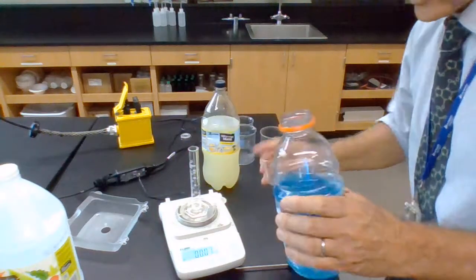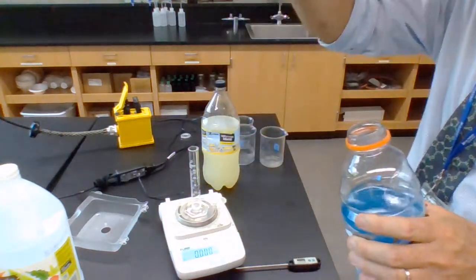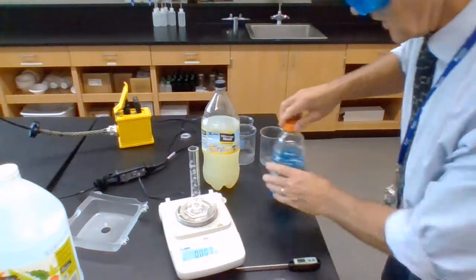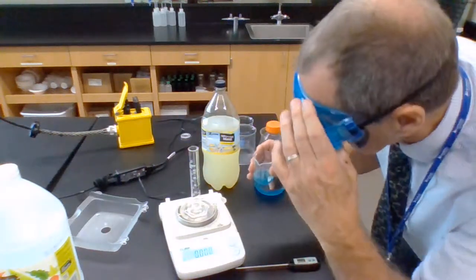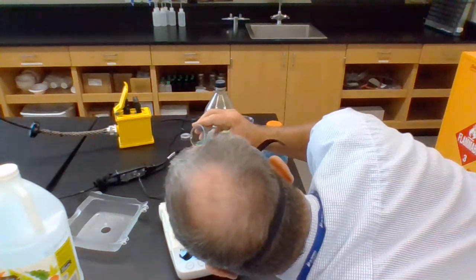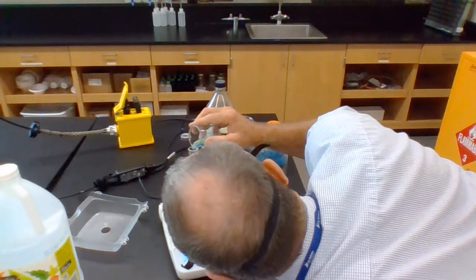Let's try the Gatorade. I'll just put a bit in the small beaker, just like the one you've got at home. And I'll make sure there's a bit more than 10 milliliters in there. Because I want to fill this to 10 milliliters. In order to do this, I have to look from the side and make sure that I measure to the bottom of the meniscus.